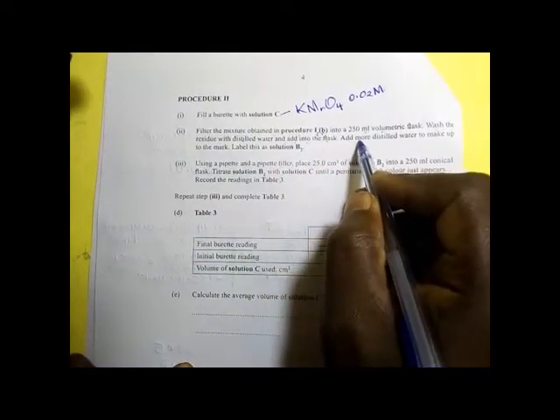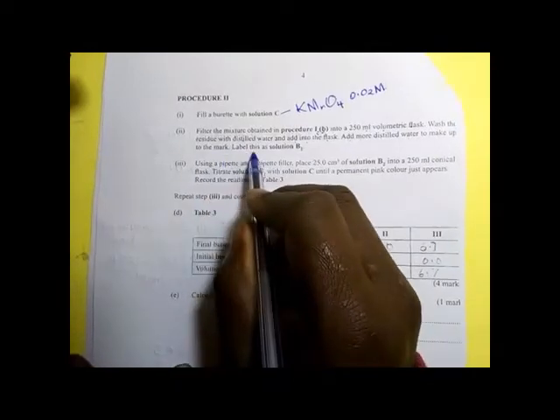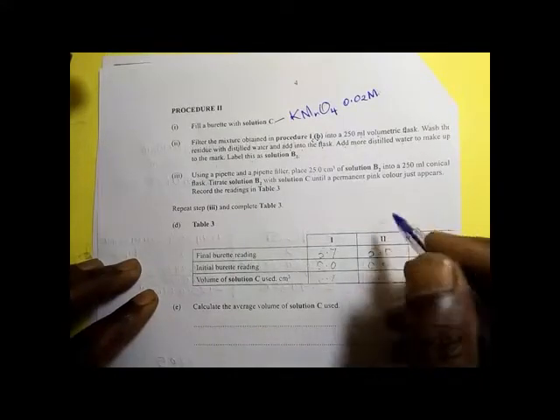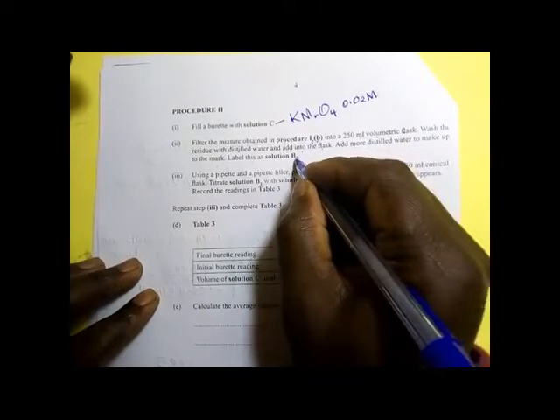Add more distilled water to make up to the mark. Label this solution B2. So here you need to understand that B2 was iron.